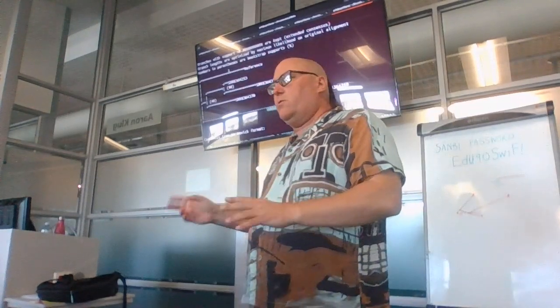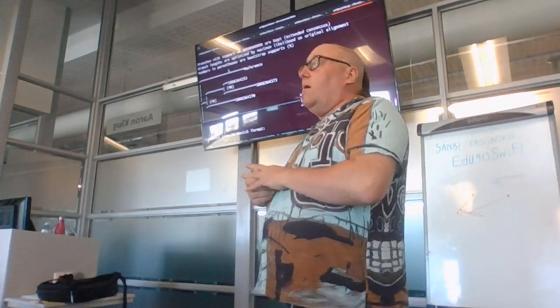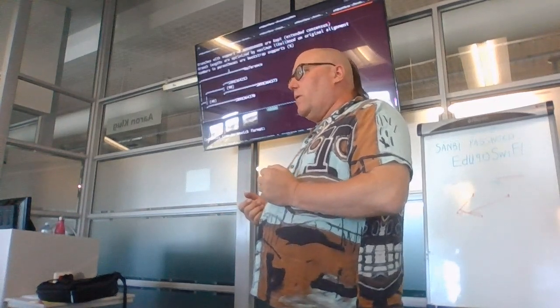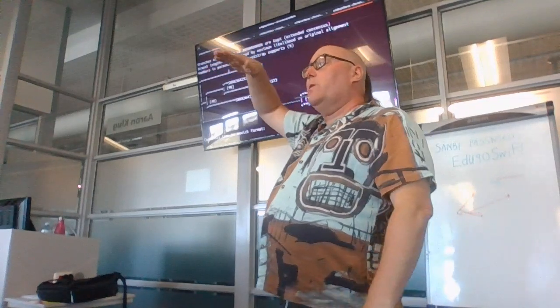And I had 30,000 variants in these branches compared to the other branches. I looked closer and found that very few of the reads were mapping. The map depth was very, very low.